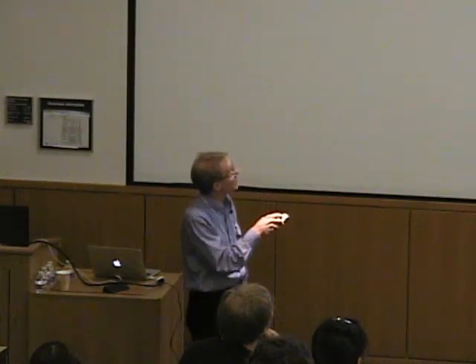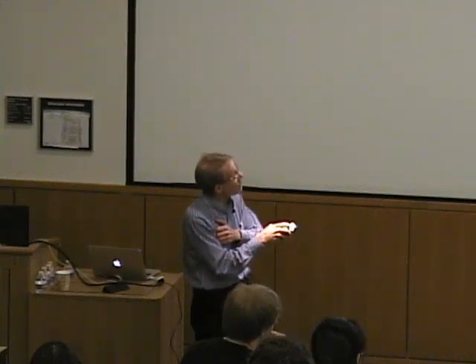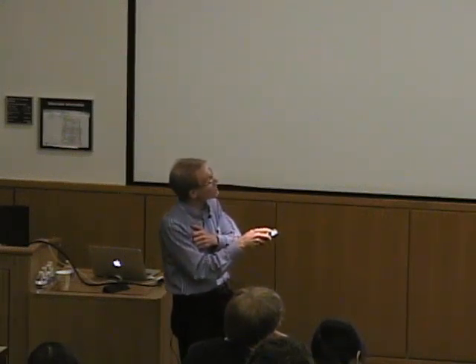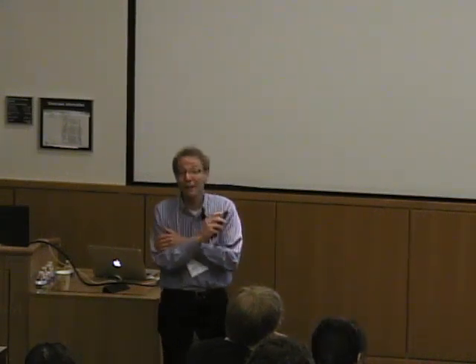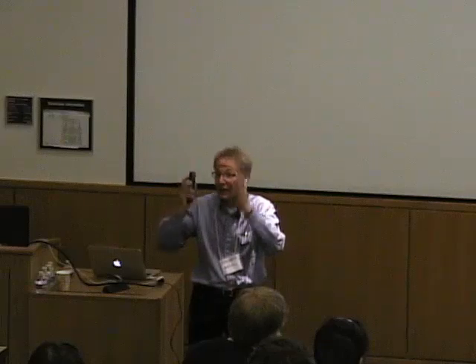Okay. A typical data set looks maybe something like this cartoon here. From the data, we extract three main pieces of information: the stoichiometry of binding, the enthalpy, from the difference between these first few injections and our final injections, and from the shape of this, we can pull out the binding constant. And here we have, as with any binding phenomena, a range over which you can accurately measure this value. Okay? In calorimetry, for these isotherms, we talk about something called the C window.